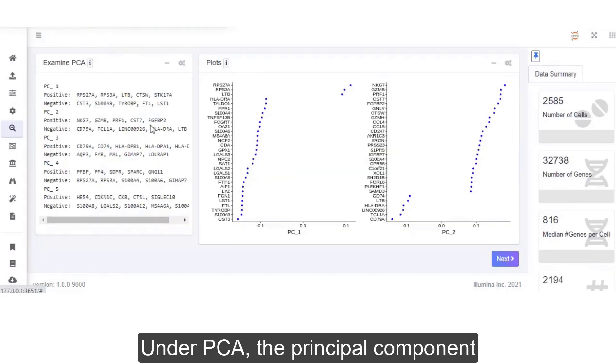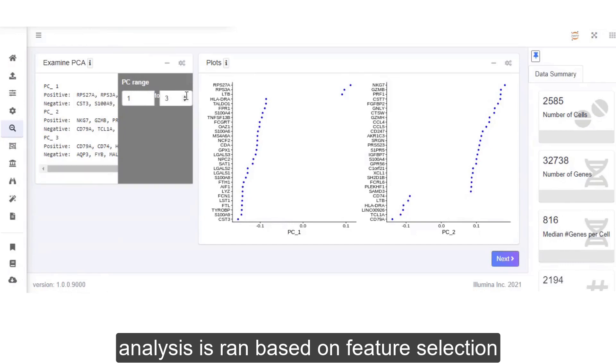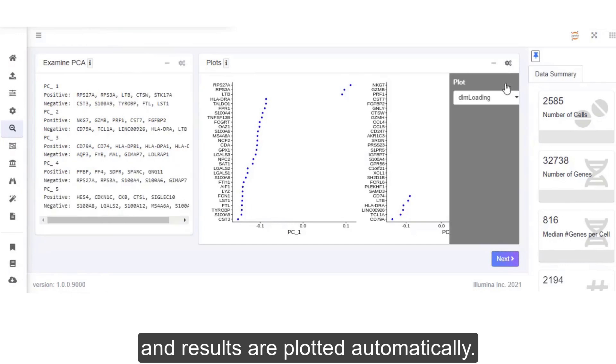Under PCA, the principal component analysis is run based on feature selection, and results are plotted automatically.